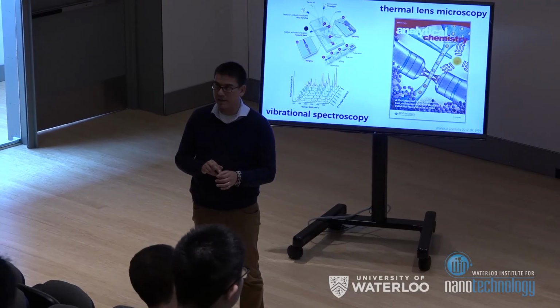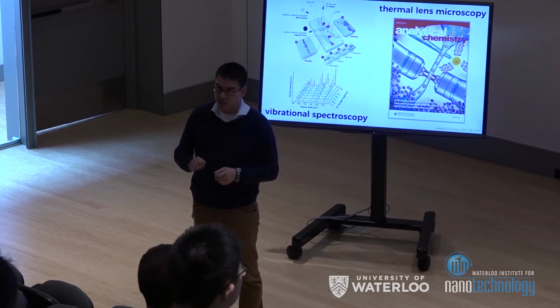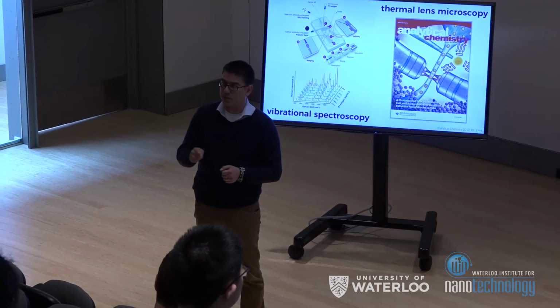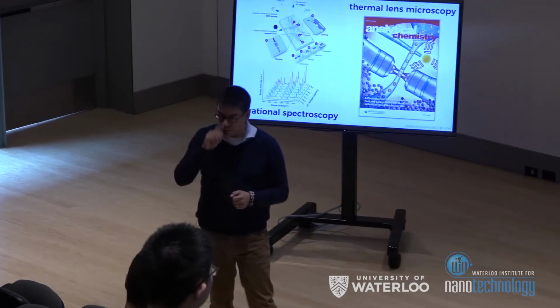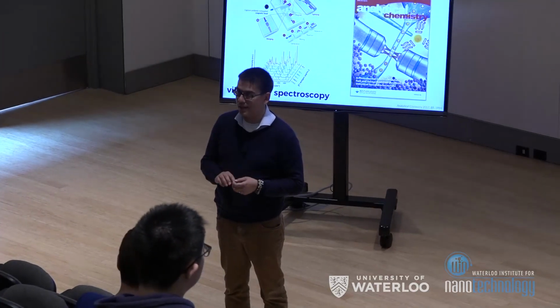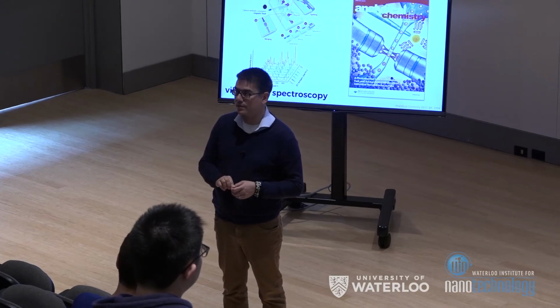Again, I haven't had time to talk about it today, but we've spent a lot of time in the past 2 years trying to develop a better understanding of how surfactants work with our continuous and aqueous phases, and also working out how we can make surfactants robustly. And it's a very, very tough challenge. So that's still work in progress. Thank you.